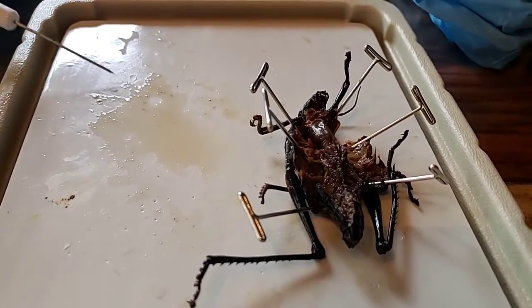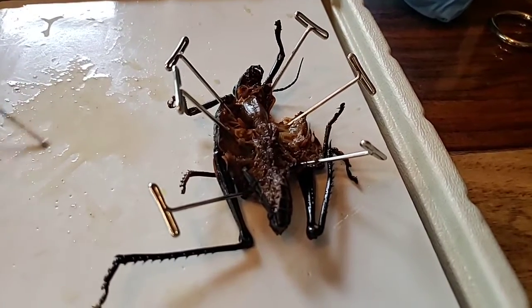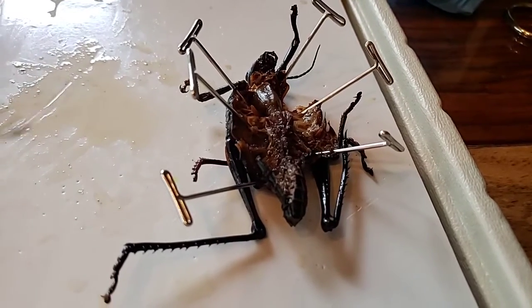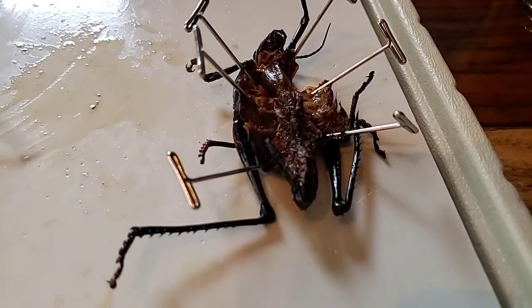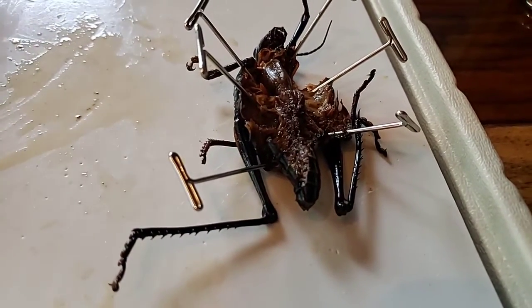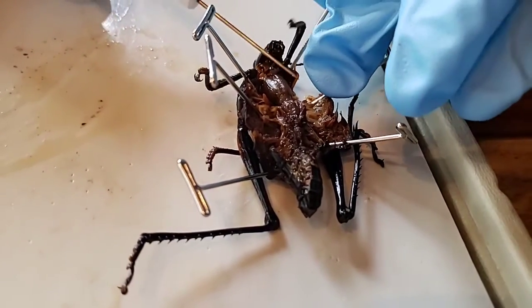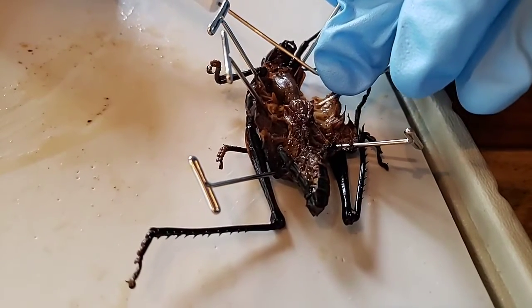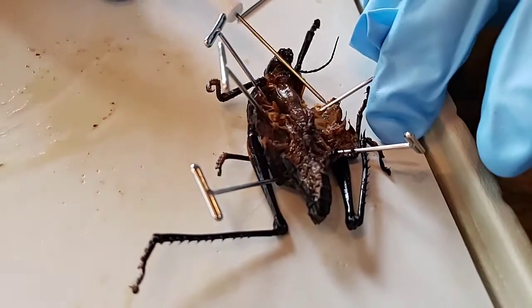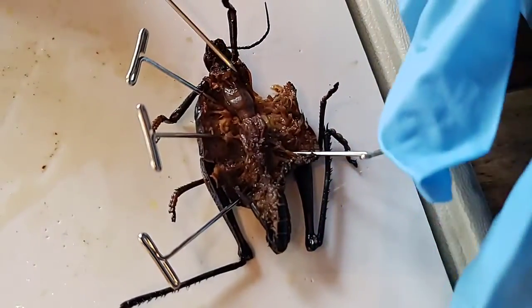All right, these four projections are used to dig a hole for egg deposits. In males, the testes is a coiled cord containing many tubules. The posterior end of the male abdomen has claspers used during reproduction. You are welcome to look at more things on this grasshopper as you explore the anatomy. I will also be posting an online grasshopper anatomy link that you can use to do your own online grasshopper anatomy. So again, the insides of a grasshopper.